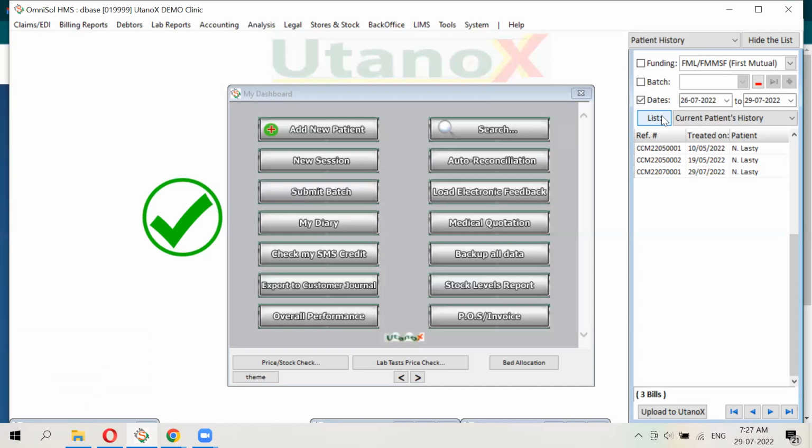Then also, not only are they fully fledged labs in these centers, but we also have, at Dr. ABC's clinic, a phlebotomist or staff working there. I would want them to be able to also register the patient and tell the patient, okay, your co-payment due is this much, and be able to print an invoice for them. Can we have a smaller system that we put in there? These ones are not running samples. They're not going to input results. They don't need everything, but they want to be able to register the patient and do the invoice.